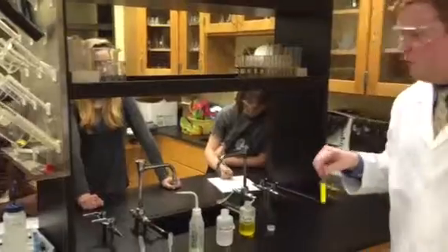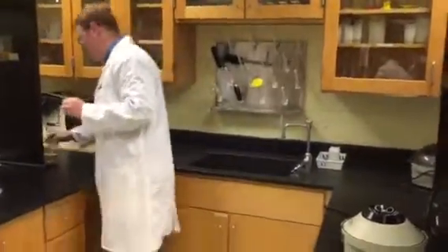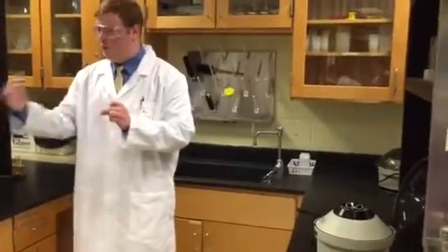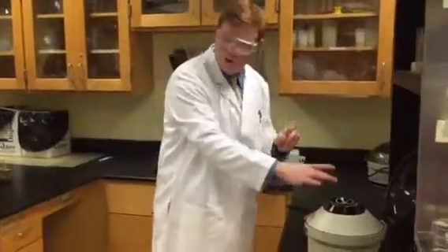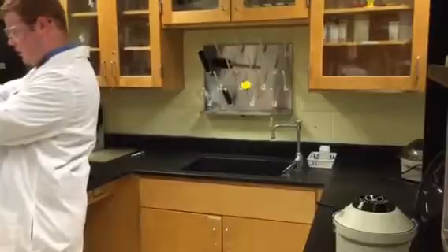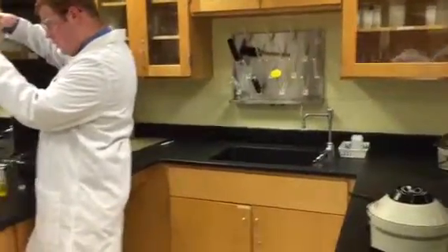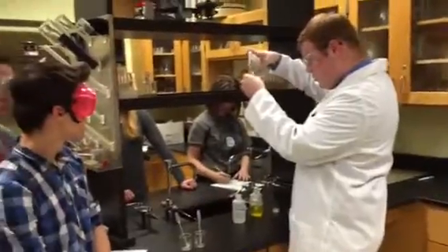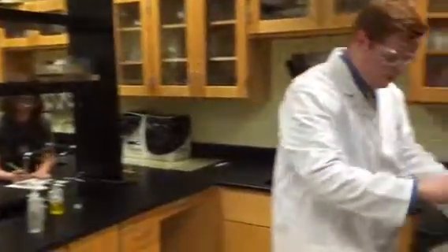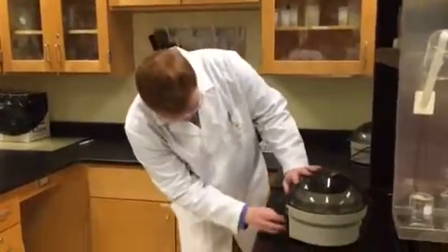So now I'm going to put it in the centrifuge over here, but before I do that I want to make sure I have an equal amount of water in another test tube so the centrifuge doesn't get off balance — because it will almost be like a washing machine sometimes. If I only put one test tube in, it's going to shake and rattle and fall off the table. So I'm going to put an equal amount of distilled water in the other test tube to equalize the centrifuge once in motion. I'm going to put them both in right across from each other and let this go for about two minutes.